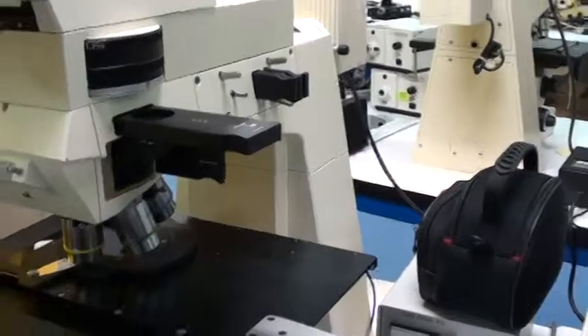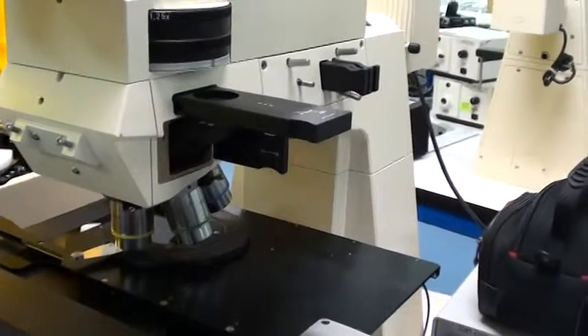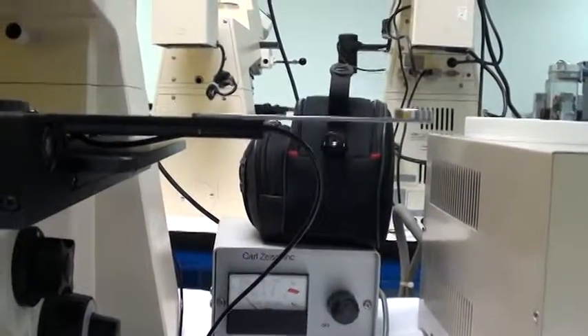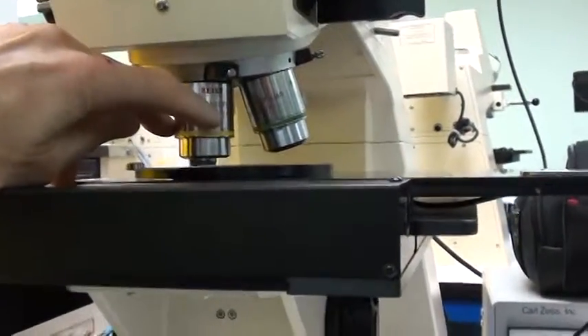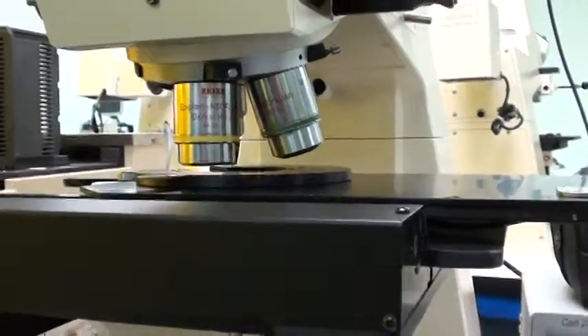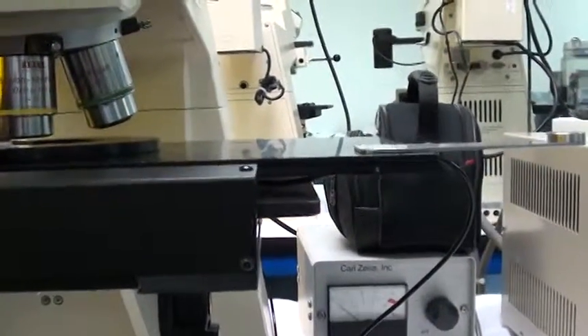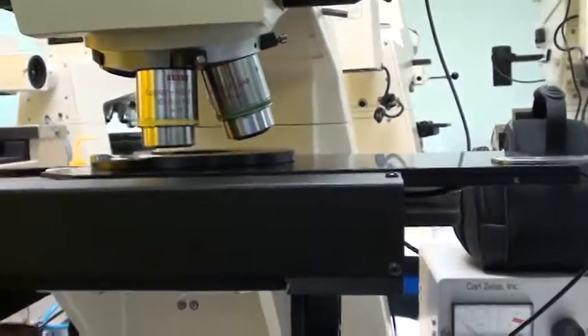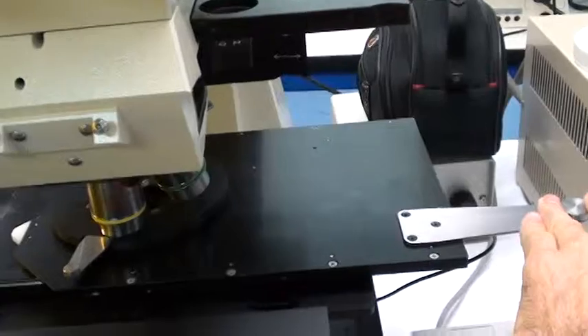I'll take you through a process so you can set this up and power up without doing any damage. The first thing to do is to make sure the objective is in the lowest magnification — the turret is on the lowest magnification objective. That is done by rotating the turret from these buttons here near the base of the microscope. Once you have it on the 10x objective, that gives the maximum clearance between the chuck and the objective. Then make sure that the stage load axis, which you see here, is all the way to the right.